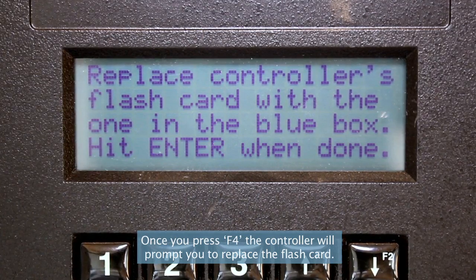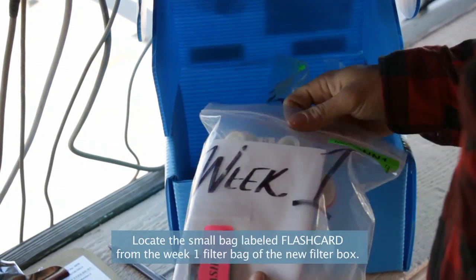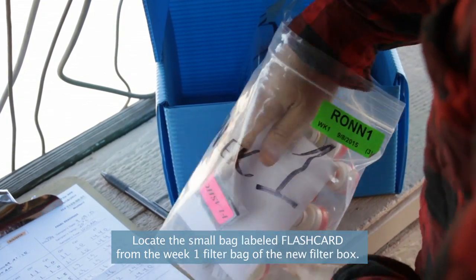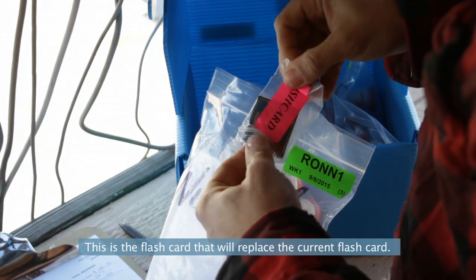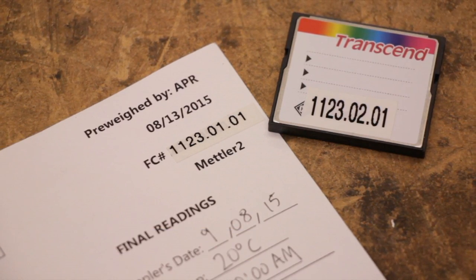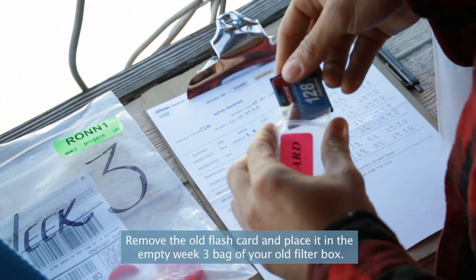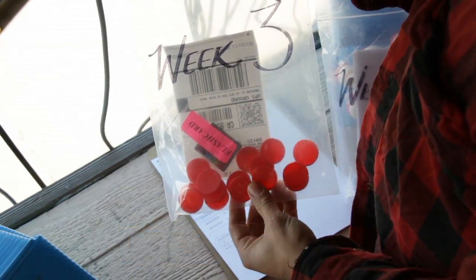Once you press F4, the controller will prompt you to replace the flashcard. Locate the small bag labeled flashcard from the week 1 filter bag of the new filter box. This is the flashcard that will replace the current flashcard. The code on the card should match the flashcard number on current log sheets. Remove the old flashcard and place it in the empty week 3 bag of your old filter box.